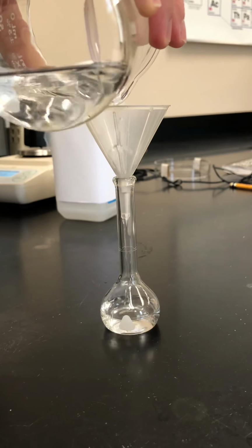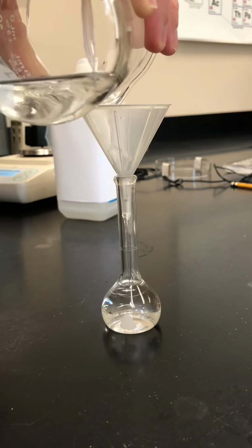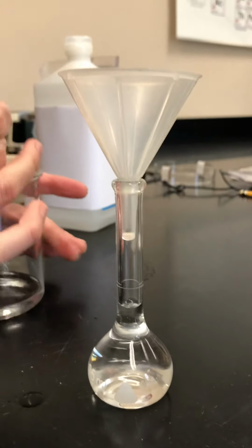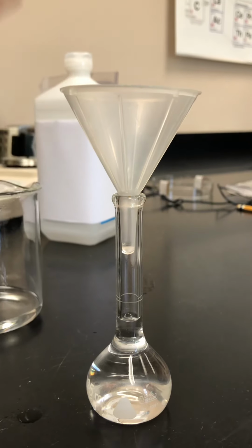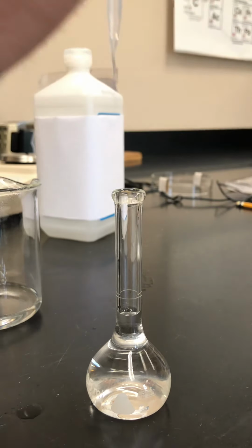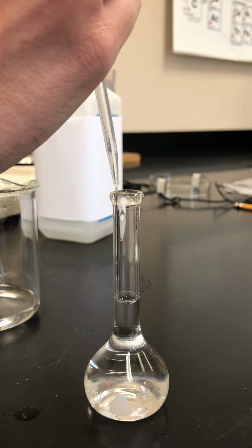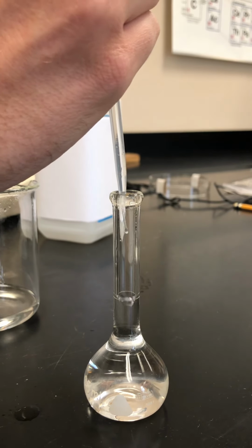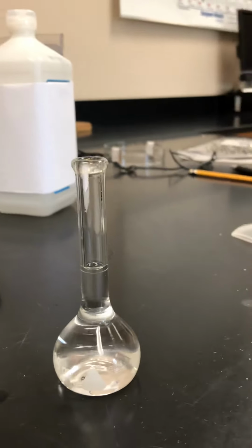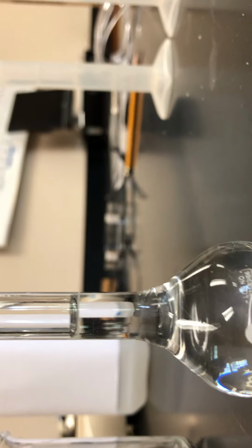So that mark is 25 milliliters. We're going to fill it up again to the meniscus, to that line. Once I get close, I'm going to stop pouring, and I'm going to use a pipette to be able to add the solution a little slower. I'm going to take my funnel out. And so we're just going to fill that meniscus up to the line. And a few more drops. And there we are. The bottom of our meniscus is at the mark of our 25 ml flask.